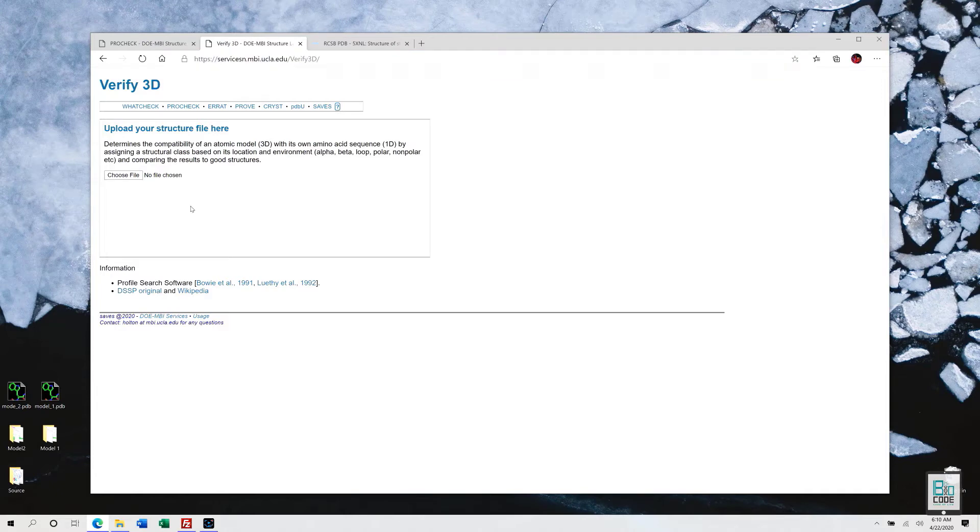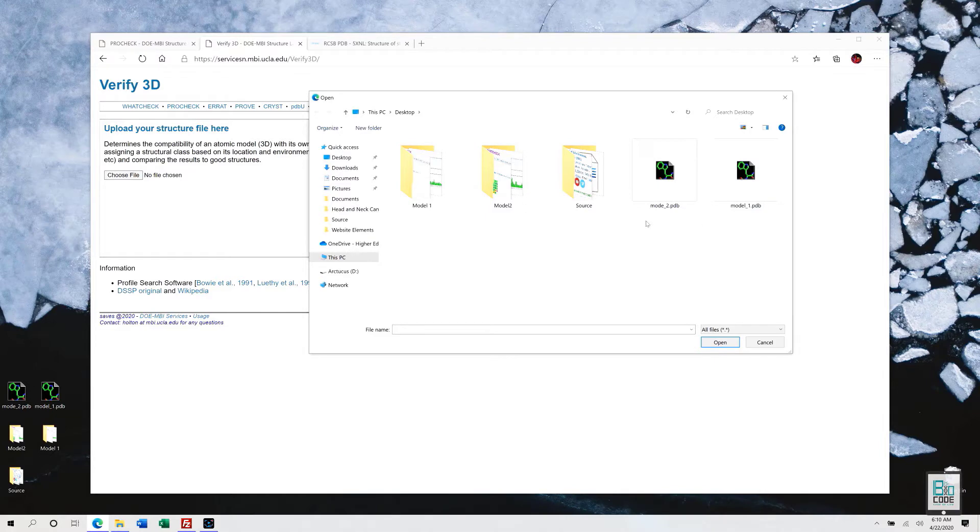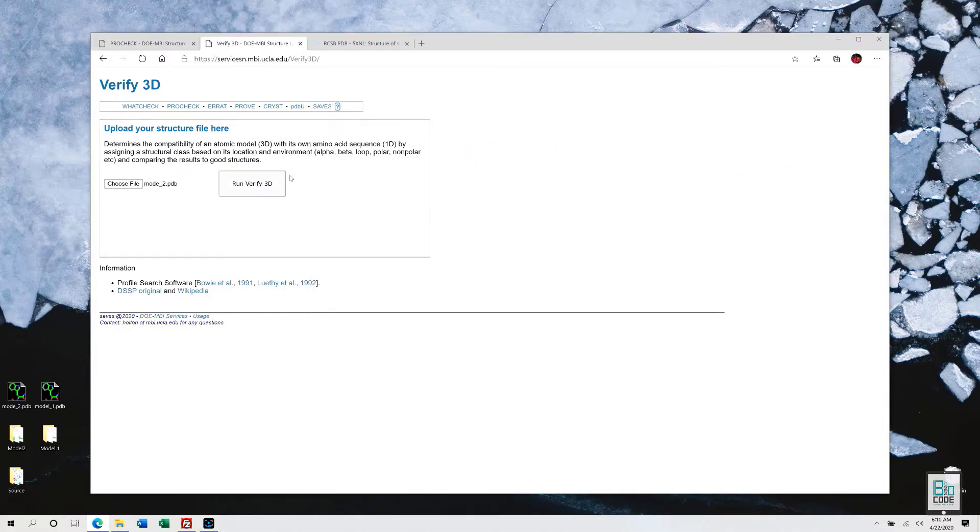I'm just going to click Choose File, and within that Choose File, I'm going to select the second model.